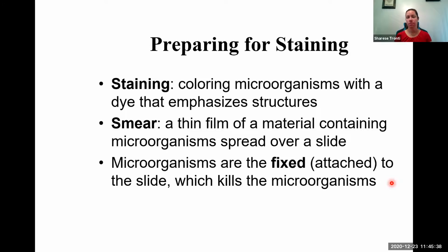And that does two things. One is that it attaches those microbes onto the slide, which is really important because as you stain it, if you don't fix it, if you don't attach it, it's just going to wash off. The second thing that fixing does is it's going to kill those microbes, which is important. It helps us be a little bit safer.